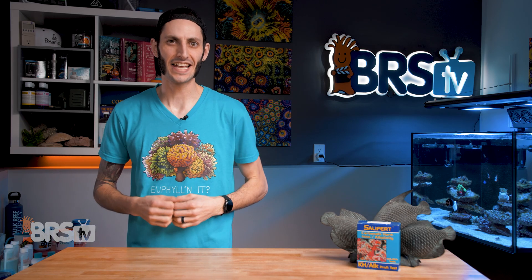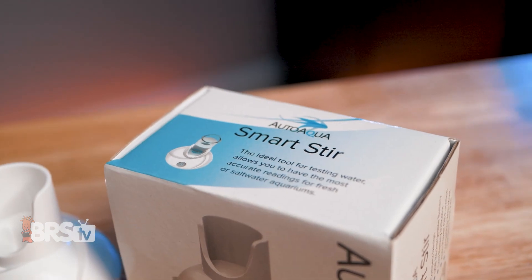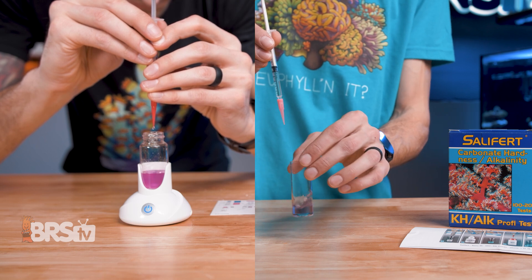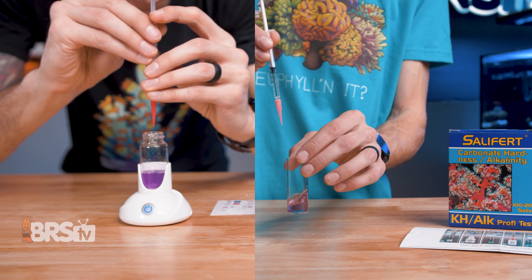A quick tip for standard test kits, and especially titration-based test kits like this one: having a small magnetic stir, like this AutoAqua Smart Stir, can help make the testing process a whole lot easier, and they're relatively inexpensive. So if you want to make this and other tests even faster to perform and more accurate, you can pick one up for around 30 bucks.